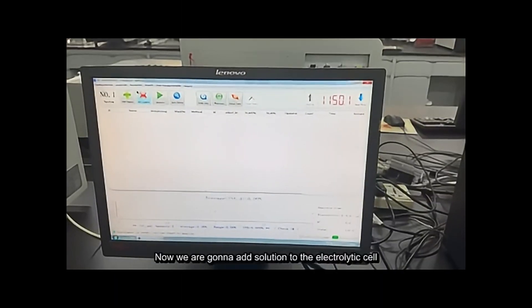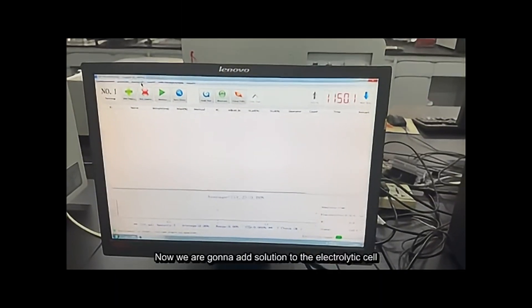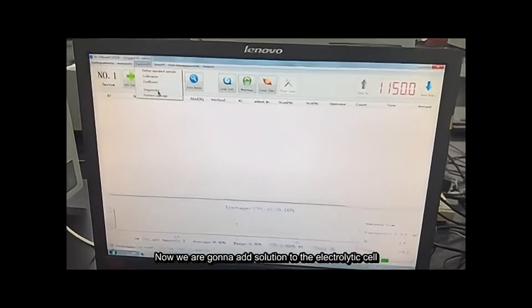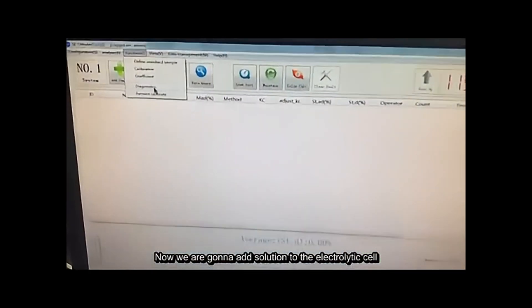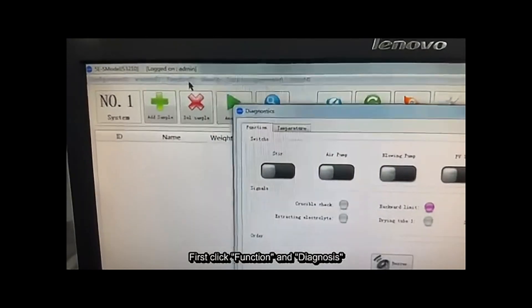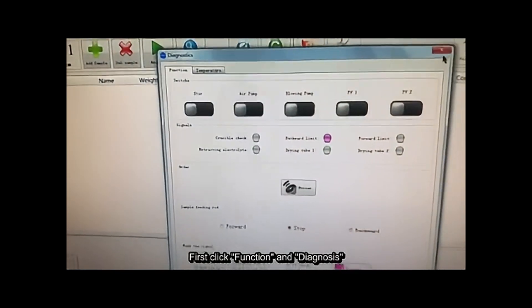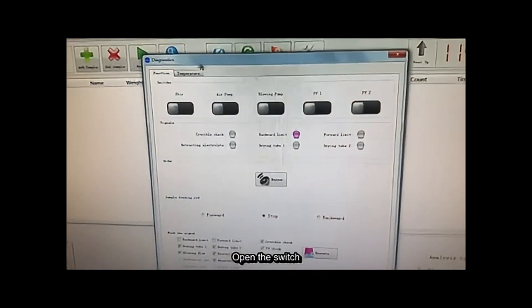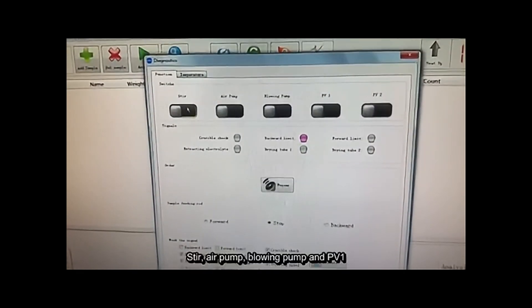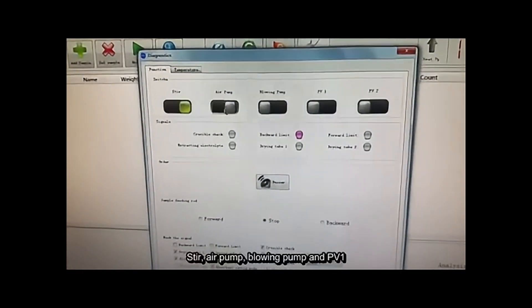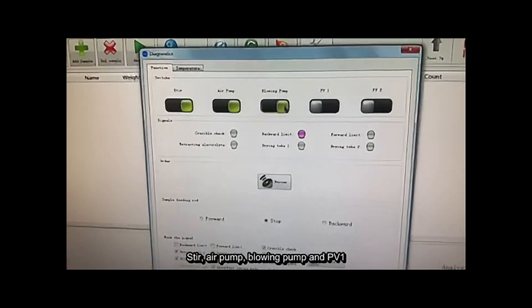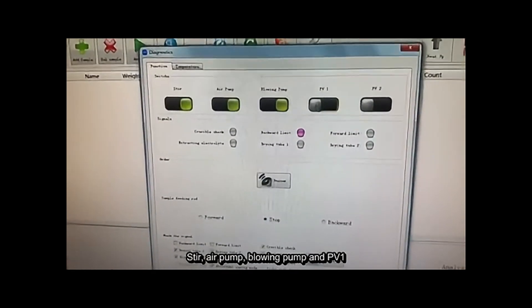Now we are going to add solution to the electrolytic cell. First, click Function and Diagnostic and open the switch: air pump, blow pump, and PV1.